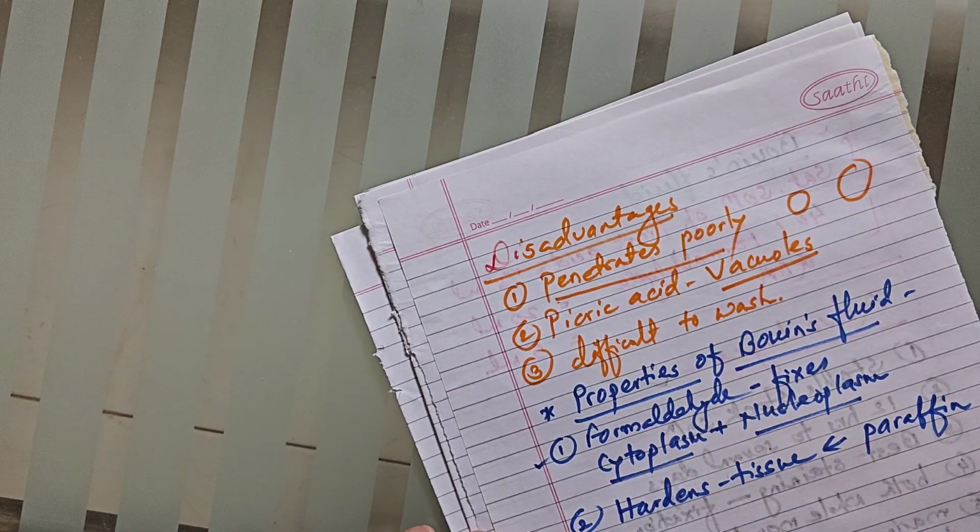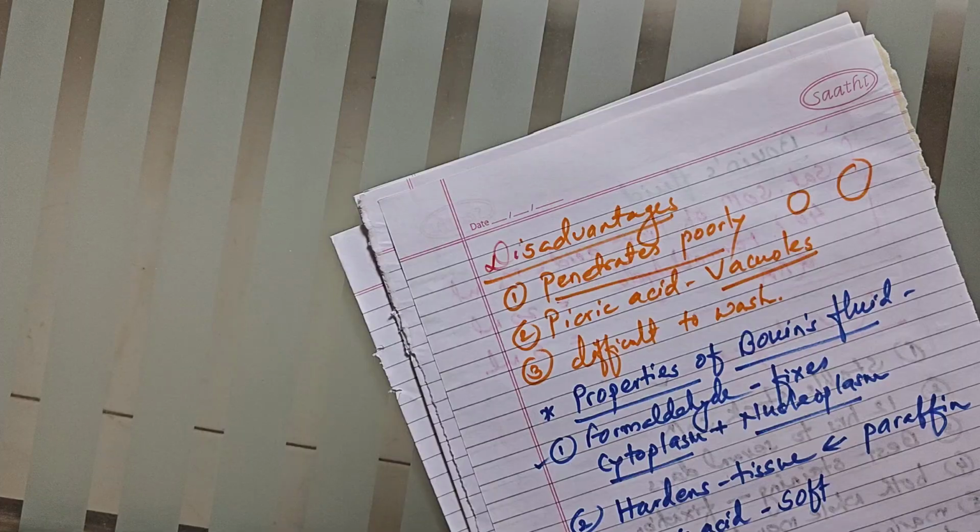But the picric acid makes the tissue soft in such a way that it readily admits the paraffin. So formaldehyde hardens the tissue, while picric acid softens the tissue, so that paraffin is readily admitted into the tissue.